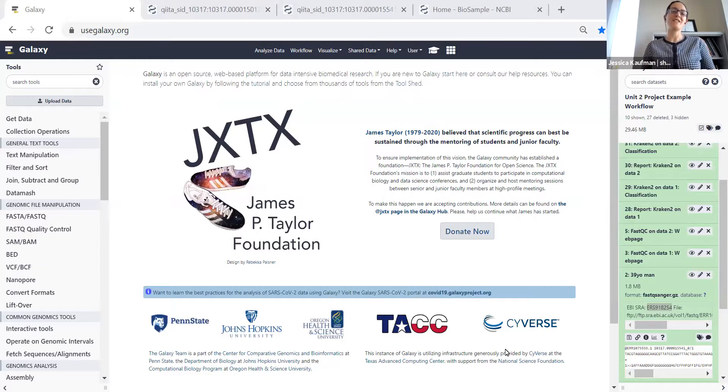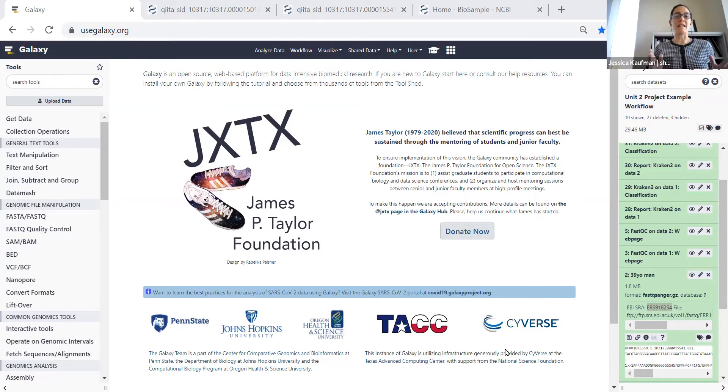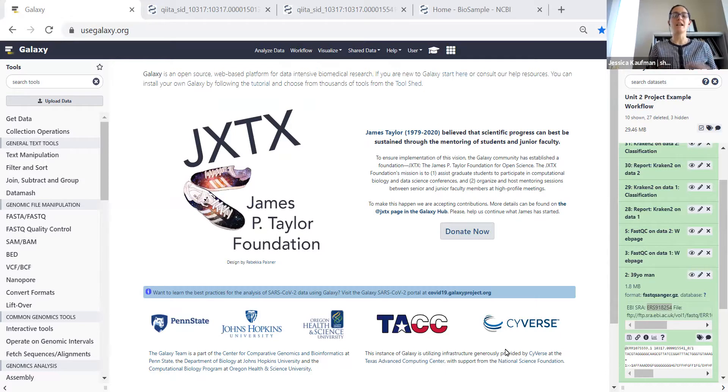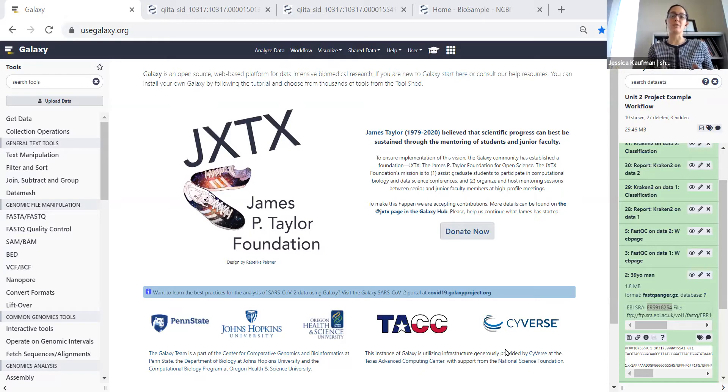Hi, everyone. In this video, I'm going to show you how to go from a database that has all of the FASTQ files for the American Gut Project and do an analysis of microbiome samples from two different individuals.